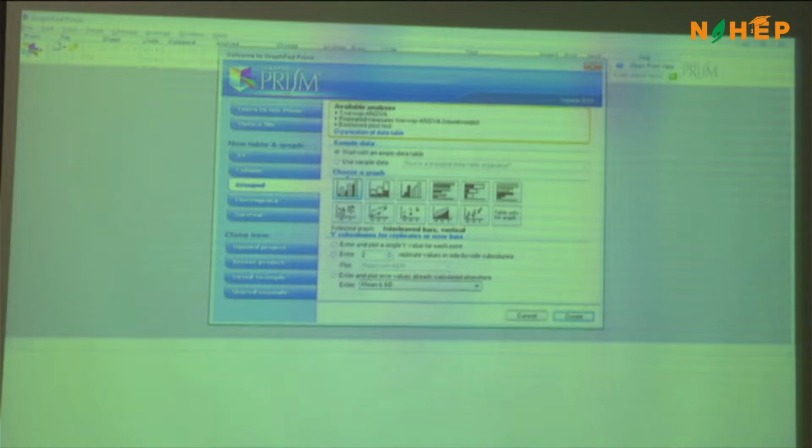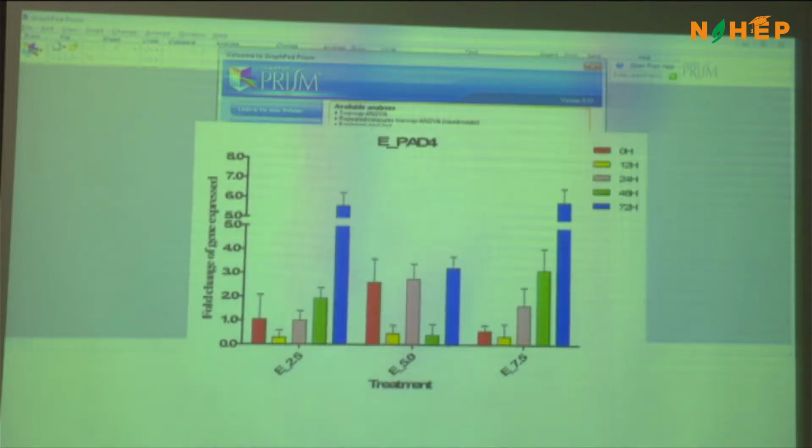So what we generally do to represent your data in a very colorful way, we generally use GraphPad Prism for that. Okay, simpler graphs are there, very informative. You can design your own things, use colors, you can make good graphs using GraphPad Prism. I will explain one. This is what I got. You can use these types of graphs for your papers. It will be very nice, from what I have seen till now.